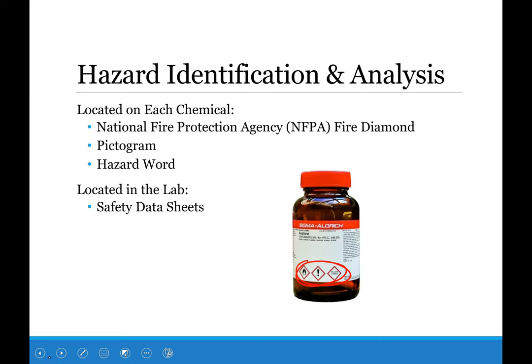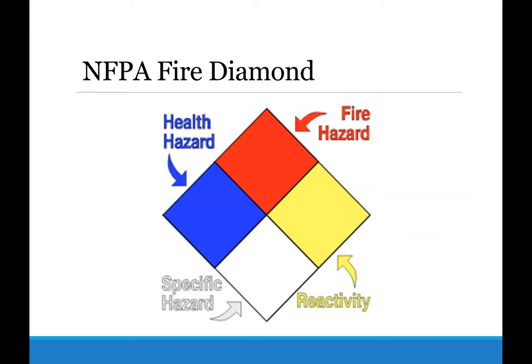Some hazard identifiers on a chemical bottle include the NFPA fire diamond, pictograms, and hazard words. The NFPA fire diamond uses colors to indicate hazards: blue is health, red is fire, yellow is reactivity, and white is any specific hazard. Each number on the diamond indicates the level of hazard — the bigger the number, the more hazardous the chemical. You will typically have to label this on your exams.